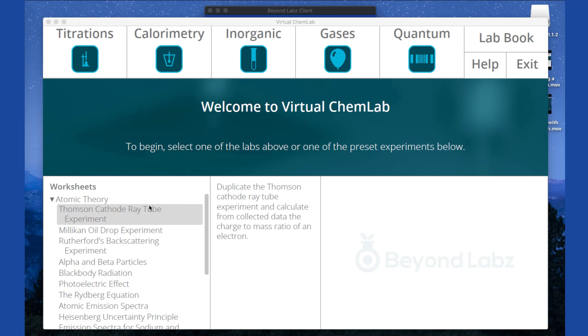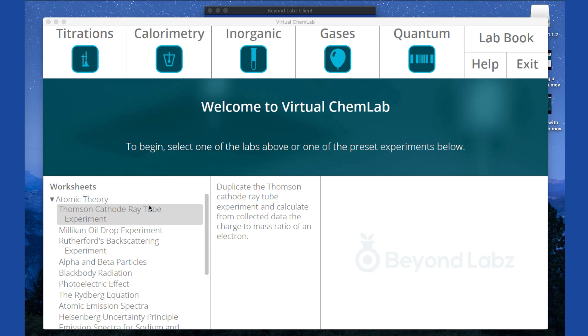Each of these worksheet links corresponds to a specific worksheet that we have of the same title. By clicking on one of these links, for example the Thompson cathode ray tube experiment, it will take the user into one of the five lab benches indicated above. But rather than having nothing set up, it will have the correct tools and instruments and reagents set up on the lab bench for the student to begin that specific experiment.